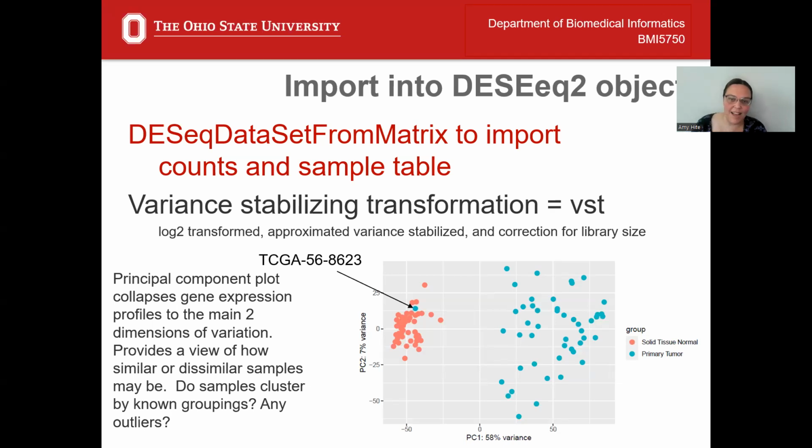Then something else I observe from this plot is in our tumor samples, there's a lot of variation. They're diffuse, they're a little bit farther away from each other. Where our normal samples, they are tightly clustered over here. So normals are really very much like other normals, and tumors are more like other tumors than any normals, but there's a large amount of variation.